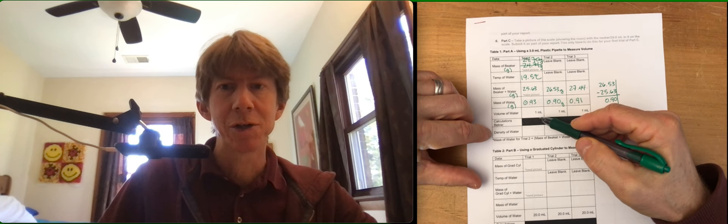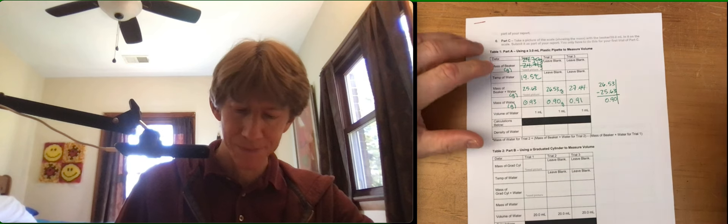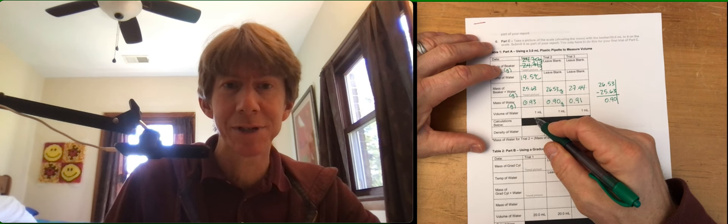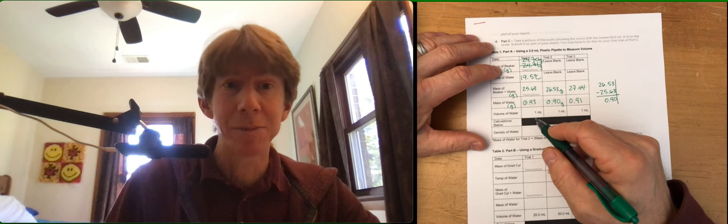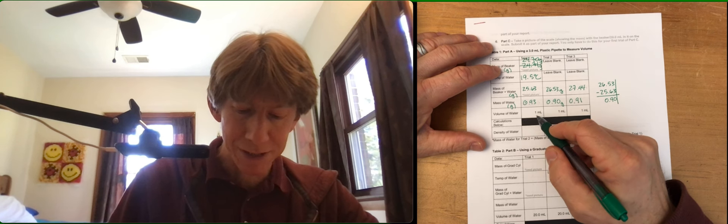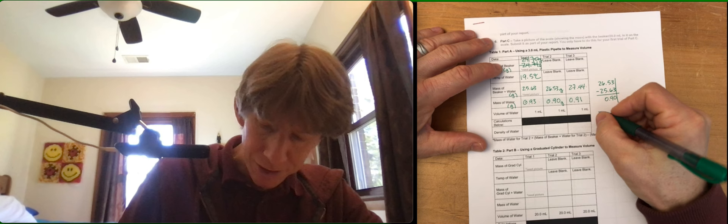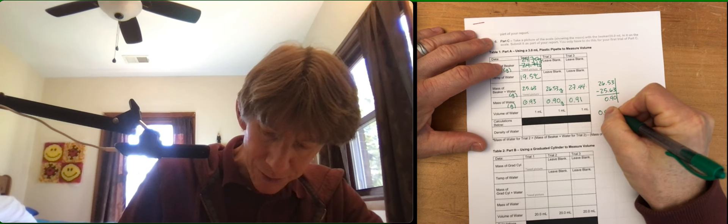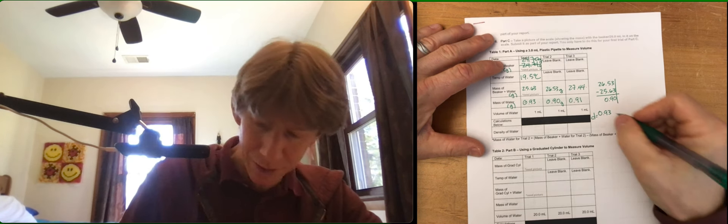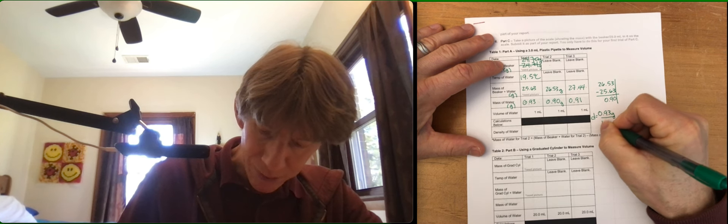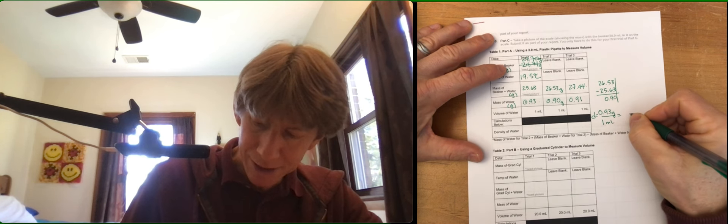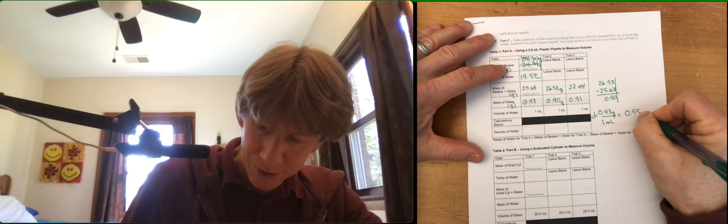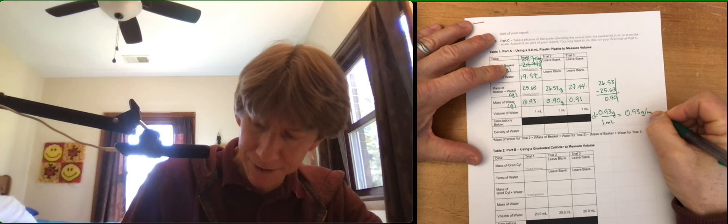Now your densities are going to be mass divided by volume. Your volume is 1 milliliter, and that does have the proper number of significant figures. There are not many markings on that pipette, so this is going to have one significant figure. And you're going to actually be doing 0.93 here. D equals 0.93 grams divided by 1 milliliter, and you get 0.93 grams per milliliter.